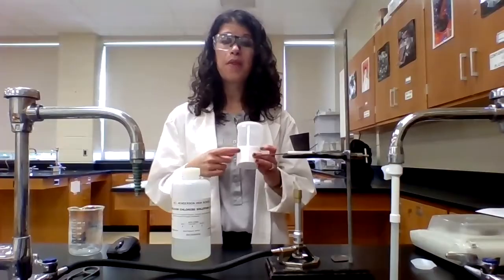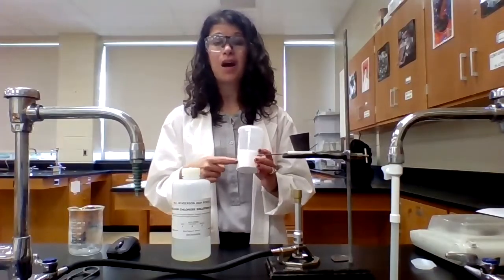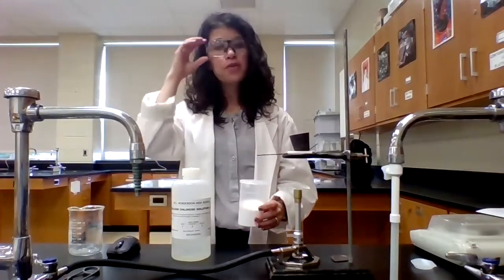We'll generate calcium carbonate. We'll collect that calcium carbonate via filtration and use the mass of that precipitate to ultimately figure out what the molar mass is of this unknown carbonate. And once we know the molar mass, we can identify which of the group 1 metals this carbonate is.